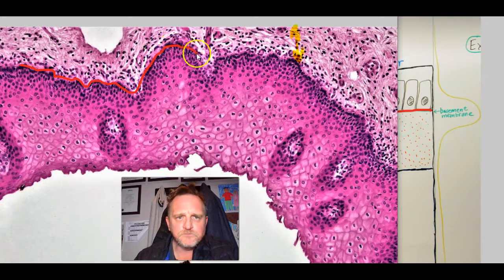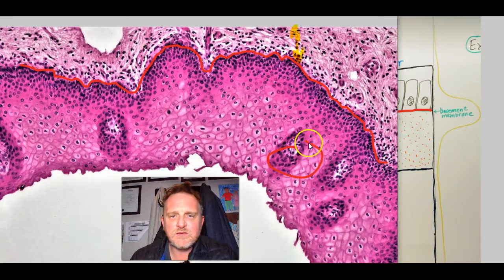Okay. And so this is a good example of what I was referring to earlier about the sketch being slightly easier, isn't it? The moment you look into this, it's kind of, whoa, where are we now? What's going on? What are these things? For now, just suspend all questions and insecurities, and just get comfortable with what you're looking at. Be with the image, and don't stress.